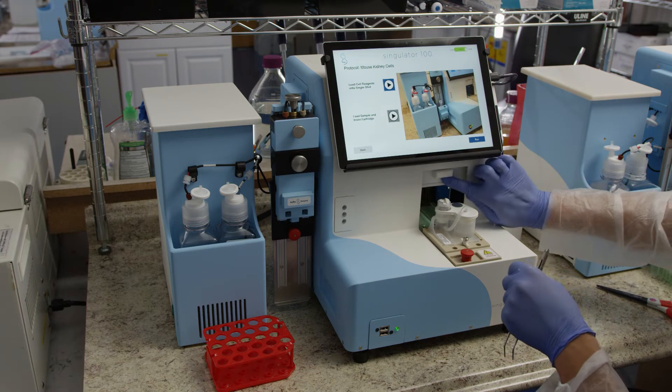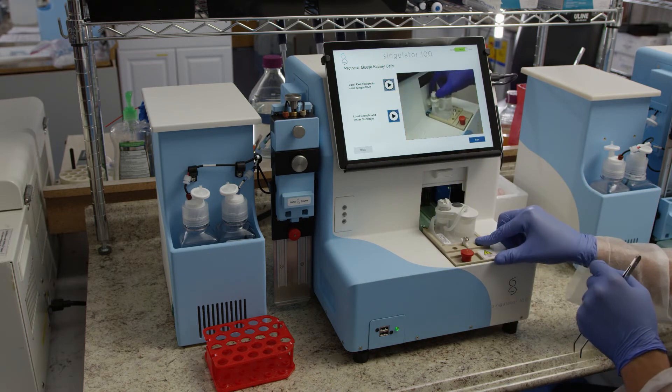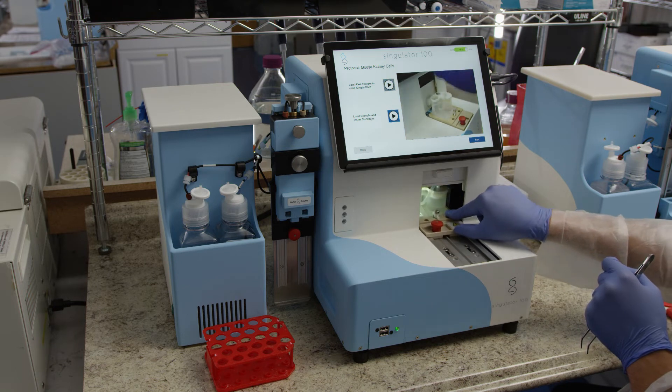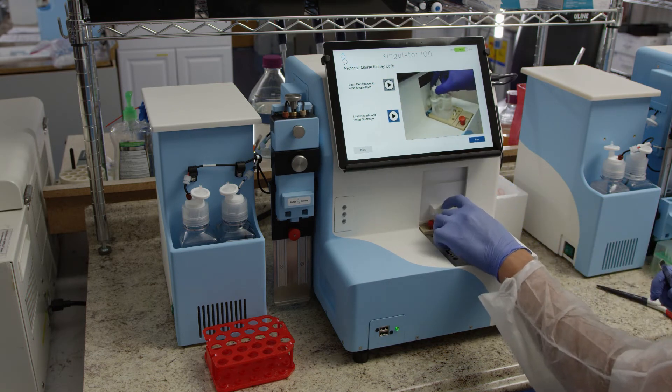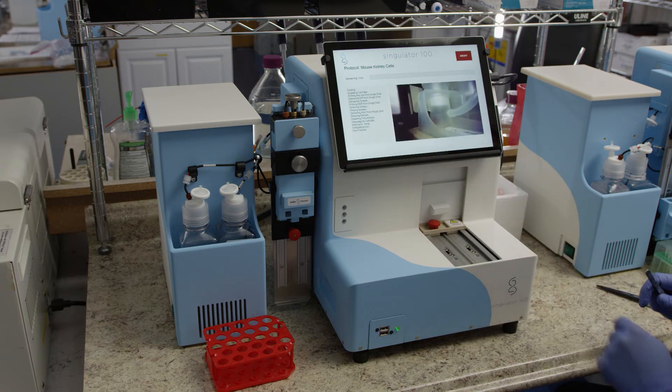Insert the cartridge into the instrument by pushing the stage from behind. It's important not to hold onto the red knob during this step. You should hear the red knob click into place when the cartridge is fully inserted. Close the door and click Next.